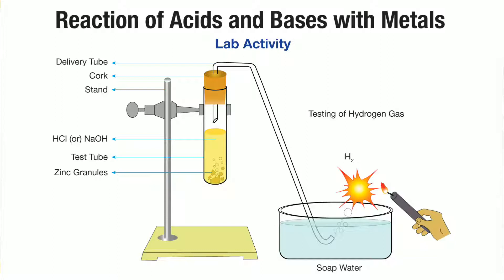For the procedure, we have to fix the test tube. After that, we have to insert the delivery tube through the stopper in the test tube. The other end of the delivery tube should be fixed into another test tube which contains soap solution. This is the required material setup and alignment.